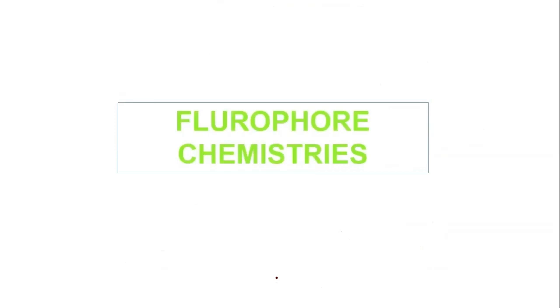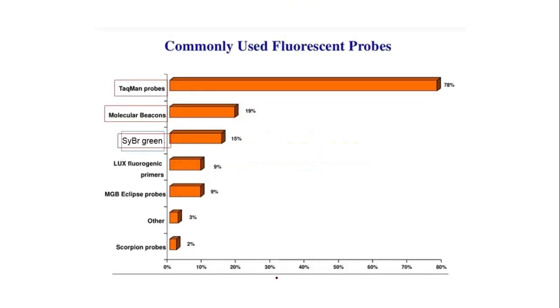We already discussed the fluorophore chemistries, where we saw about TaqMan probes, molecular beacons, and SYBR Green.